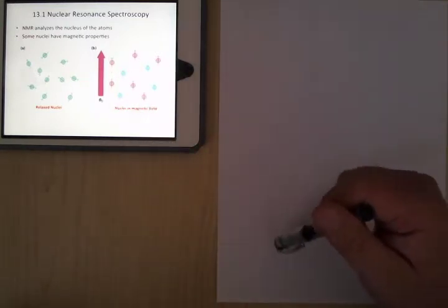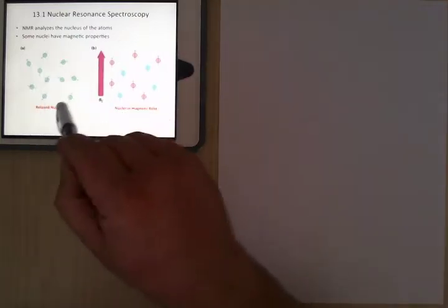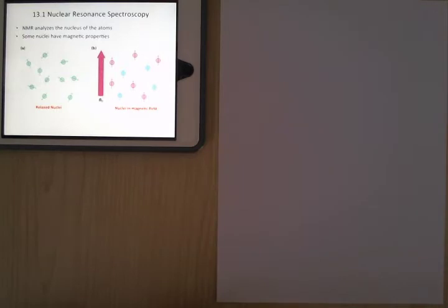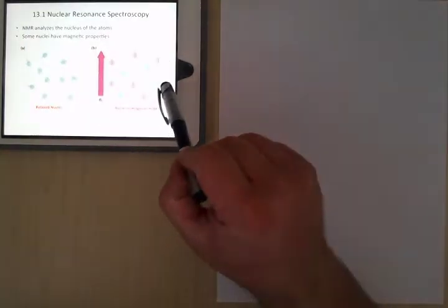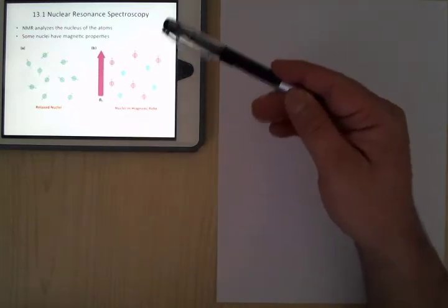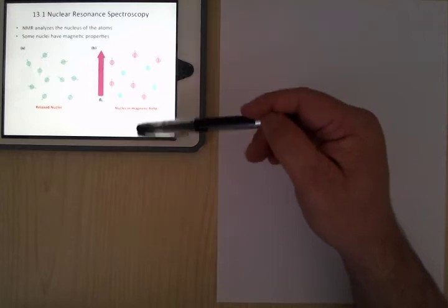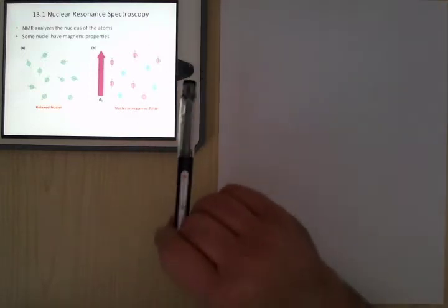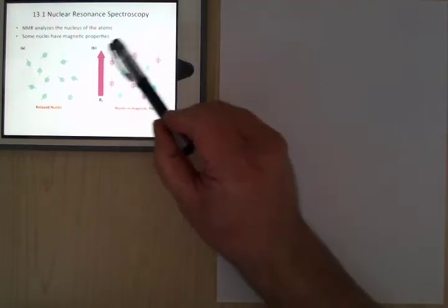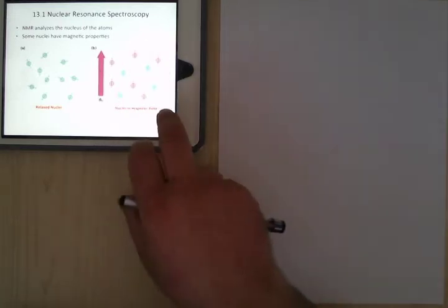So think of sheep wandering around a field, because they can go wherever they want. But if you're talking about a school of fish, the easiest way to travel is either upstream or downstream. If the magnetic field's there, you're going to go up and down, so they're going to align with it. And we're going to take advantage of this alignment within this magnetic field.